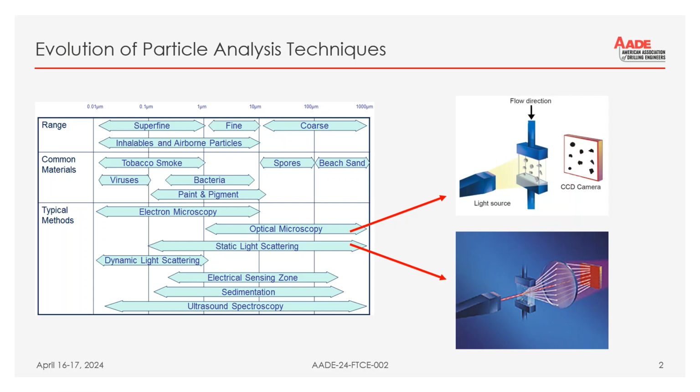Basically, you have a light source and you're taking images of these particles. Yes, there is a measure that will give you particle size as if they were round, but there's also the ability to give you shape measures: how round they are, how smooth they are, how dark they are, the length, the width. So these are the two techniques we're going to be talking about.